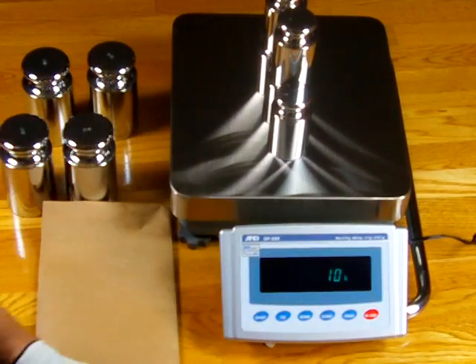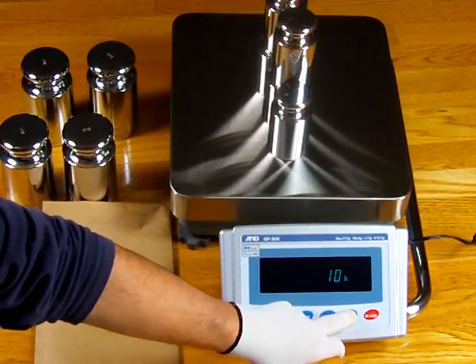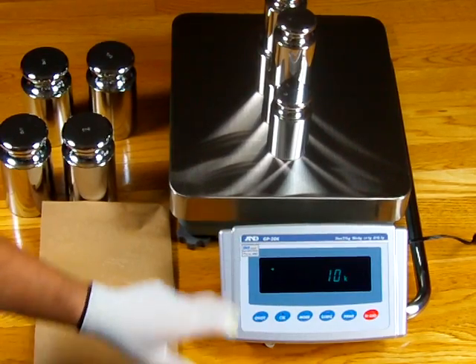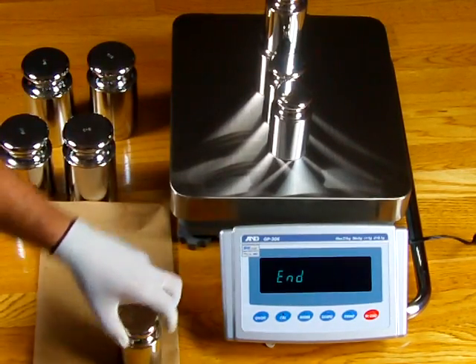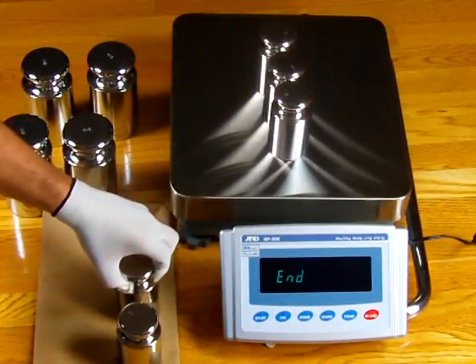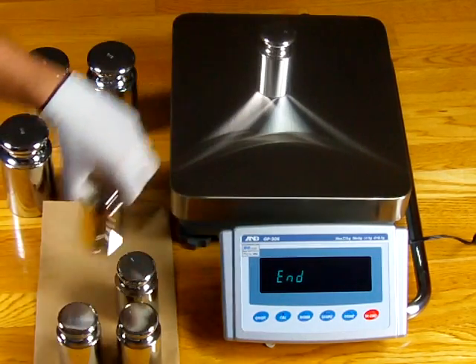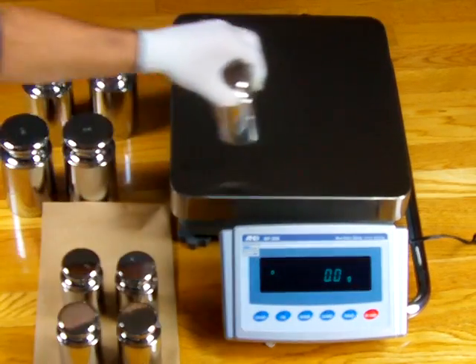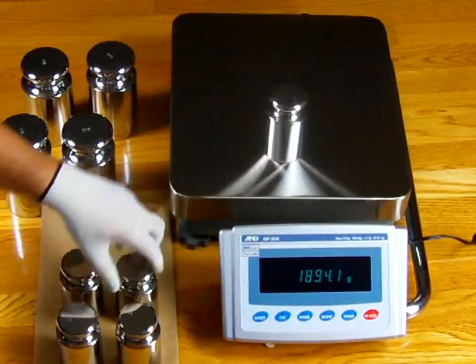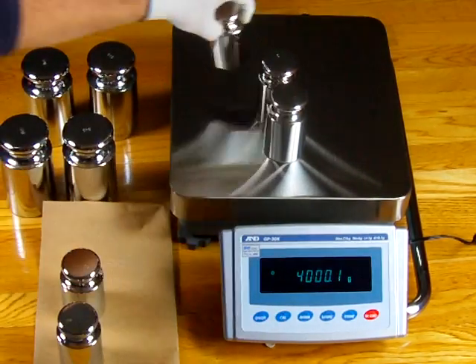When we have 10 kilograms on there, we store it by pressing the print key. You'll notice that arrow in the upper left-hand corner — it's storing the value. It says END. We remove the weights, the balance goes to zero, then we put them back on, and look — every time we're right on the money.